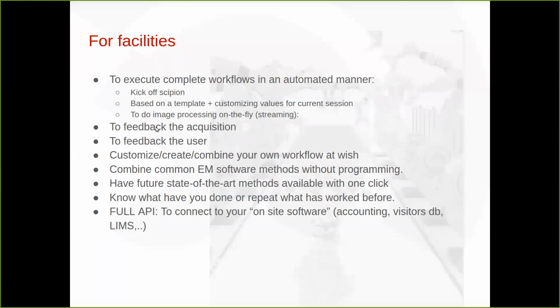The benefit of this is you can feed back the acquisition and make decisions on the fly. So if the acquisition is going wrong, maybe you want to stop the microscope. Why waste time and money on that acquisition if it's really going bad?